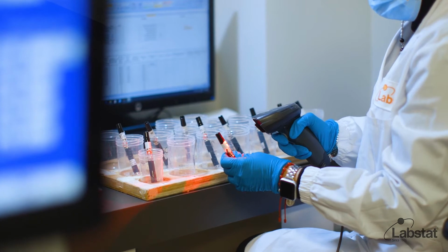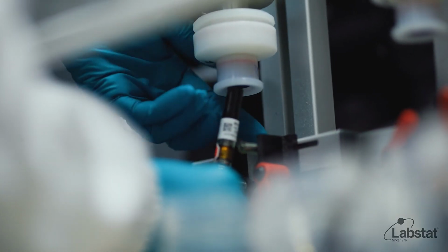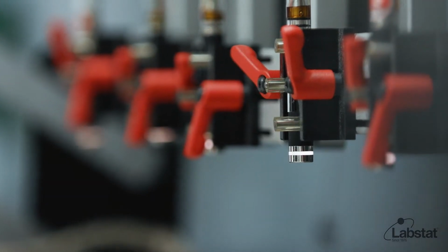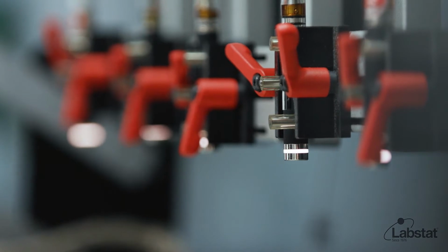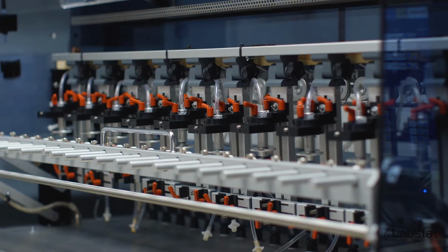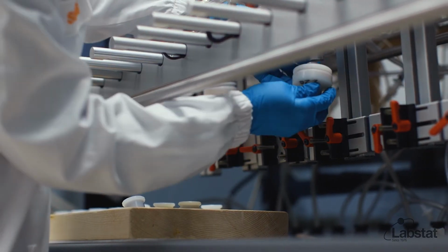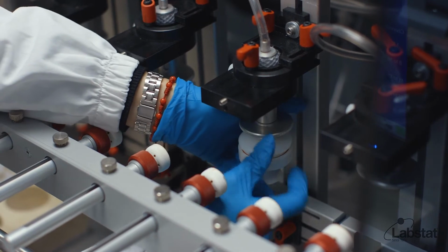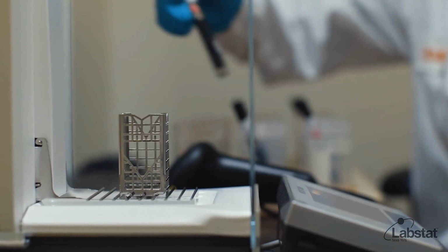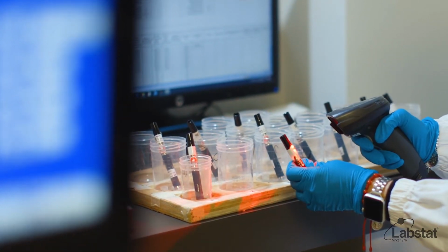Once the device has been cataloged and weighed, the technician securely attaches each device to the pad holder mouthpiece, ensuring a tight seal. Several replicates of the same device are always tested to monitor device consistency and provide an accurate representation of product performance. At this stage, it's important to remember that the same device may perform differently when used with various types of extracts. Viscosity, density, and atomizer designs all influence the interaction between the liquid and the device.